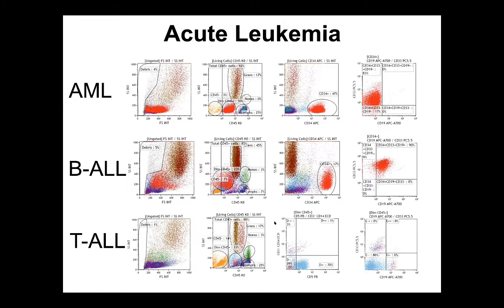Here are three examples. The first row is from an AML case. The BLAST population is around 50%; they are CD34 positive and CD33 positive, confirmed using our acute leukemia panel. The middle row is from a B-ALL case; the BLASTs are CD45 negative, bright CD34, CD19 positive with aberrant CD33.